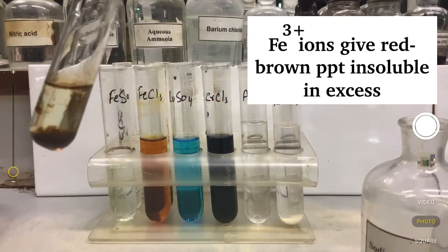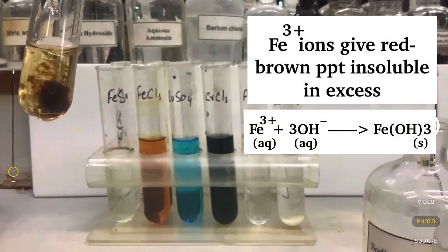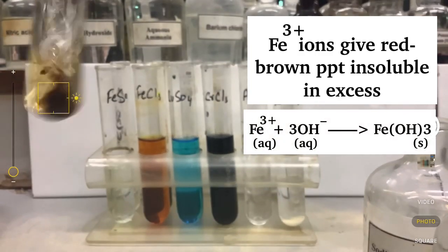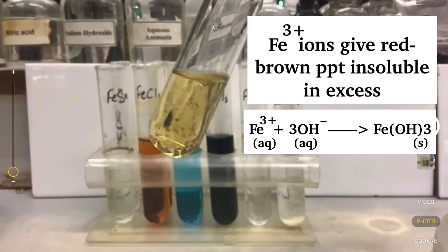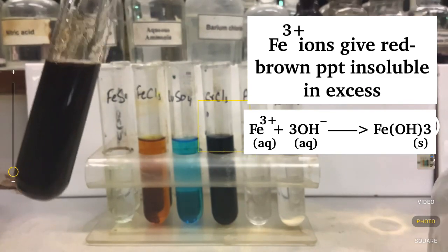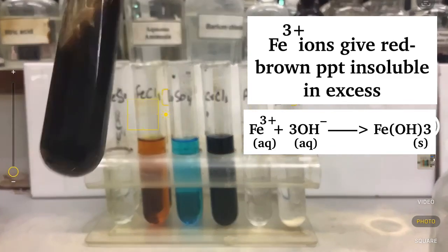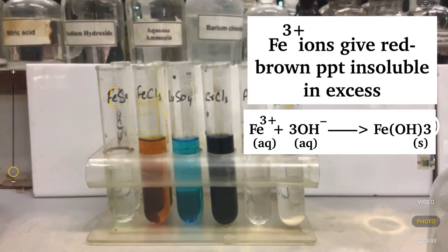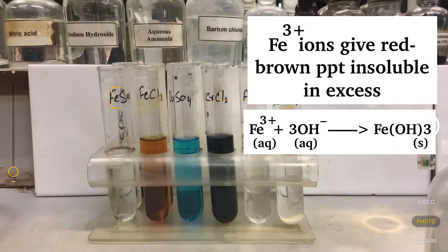You can clearly see that these are the red-brown precipitates made when a small amount of aqueous sodium hydroxide was added. These precipitates are none other than iron 3 hydroxide made by the precipitation reaction. If you add excess, the red-brown precipitates will remain insoluble in excess. So iron 3 ions give red-brown precipitates which are insoluble in excess.